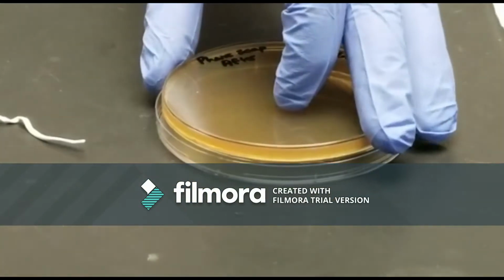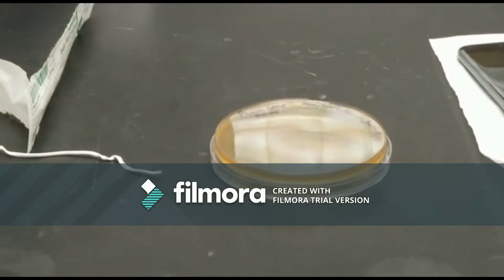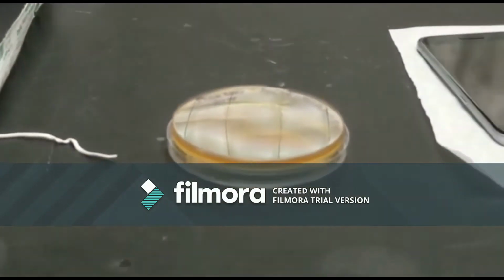The plate was labeled and placed in the 28 degrees Celsius incubator for 24 hours and then moved to the cold room.